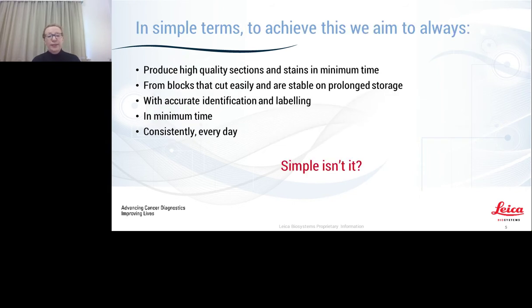So in simple terms, what we are trying to do every single day is produce high quality sections and stains in minimum time from blocks that cut easily and are stable on prolonged storage, with accurate identification and labelling in minimum time and consistently every day. Simple, isn't it?